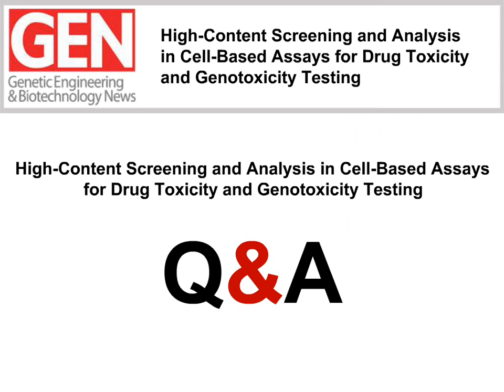All right, Heather, here's another one for you. How many plates, 96 well or 384 well plates, can you screen per day? How many minutes do you need to measure one 96 well plate or a 384 well plate? Okay, so our assay actually takes place over about 4 days because it's got an incubation time, but we usually do this in 10 to 20 plate batches at a time, just because that's a nice number to handle for our robots and stuff.